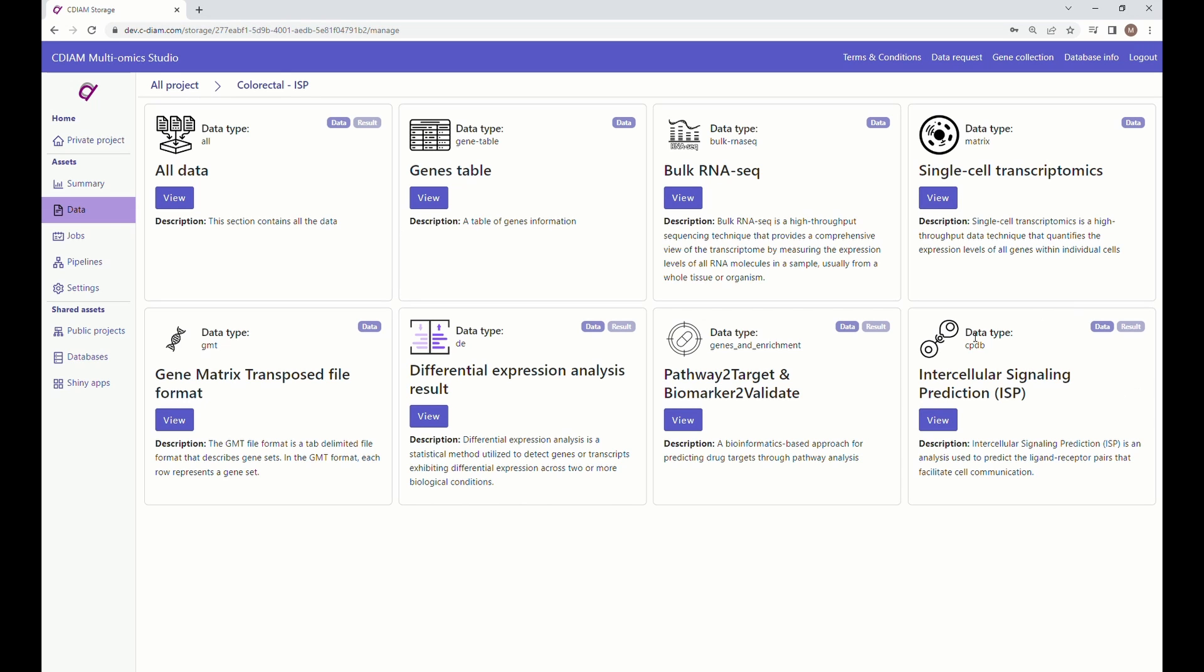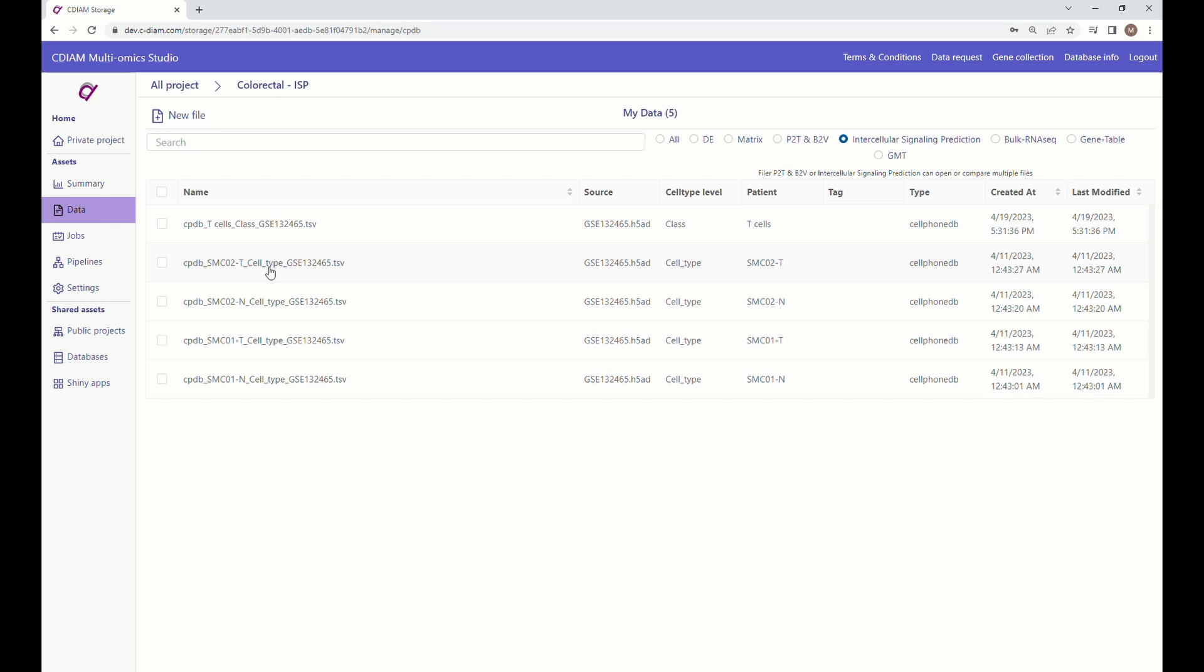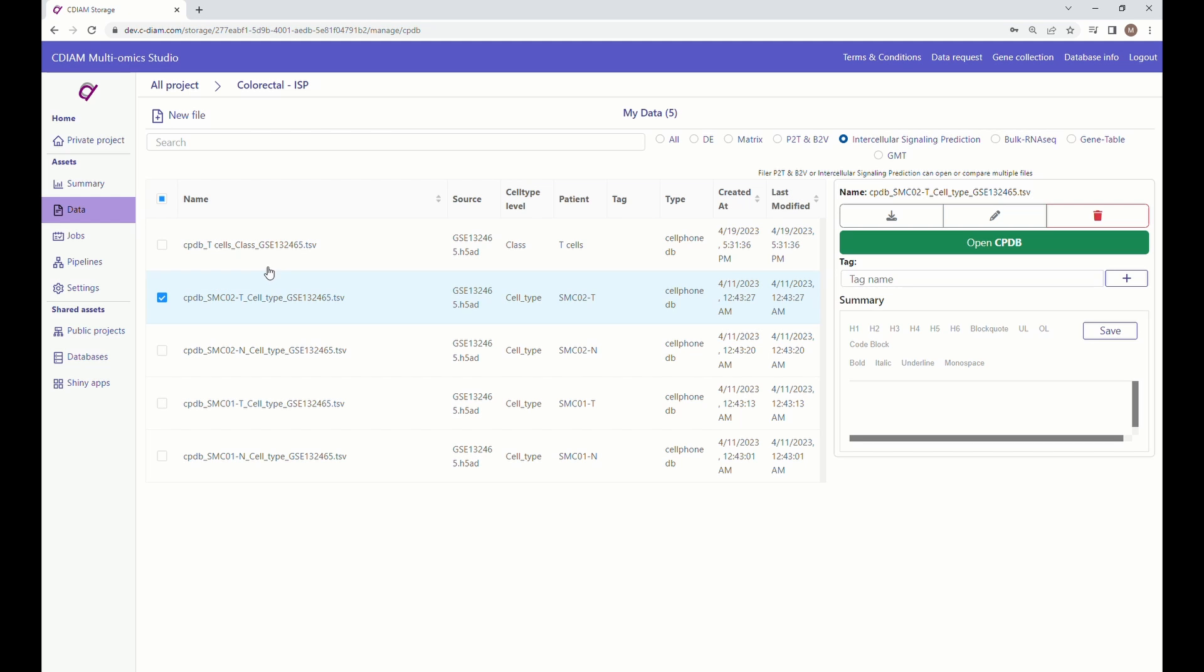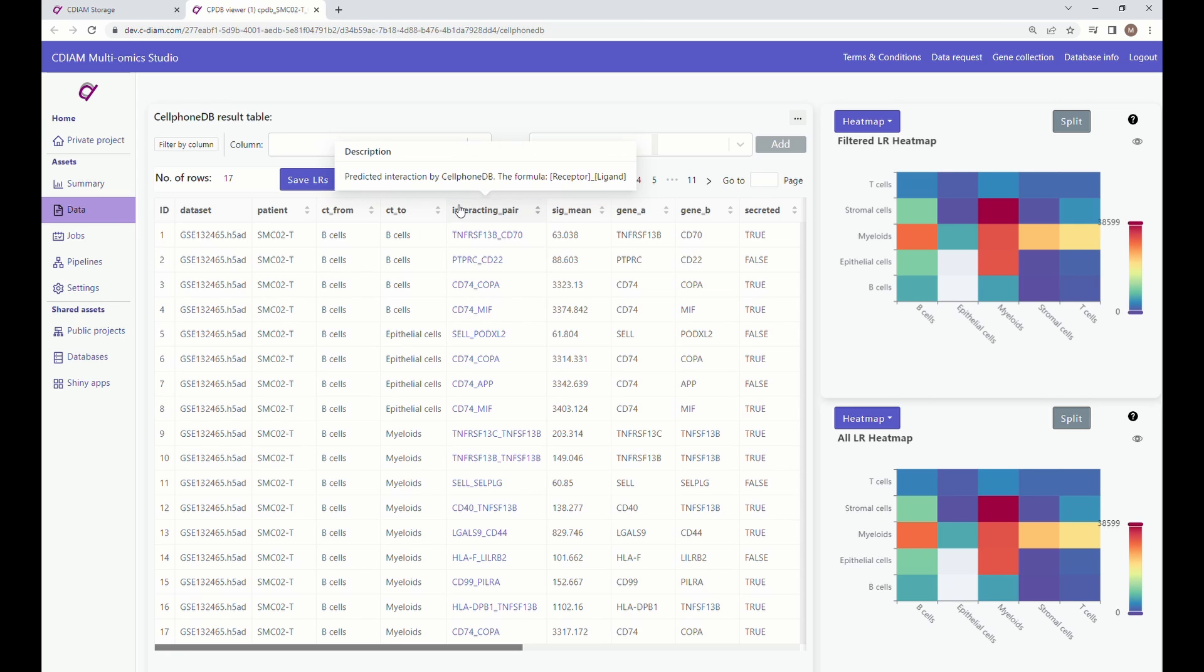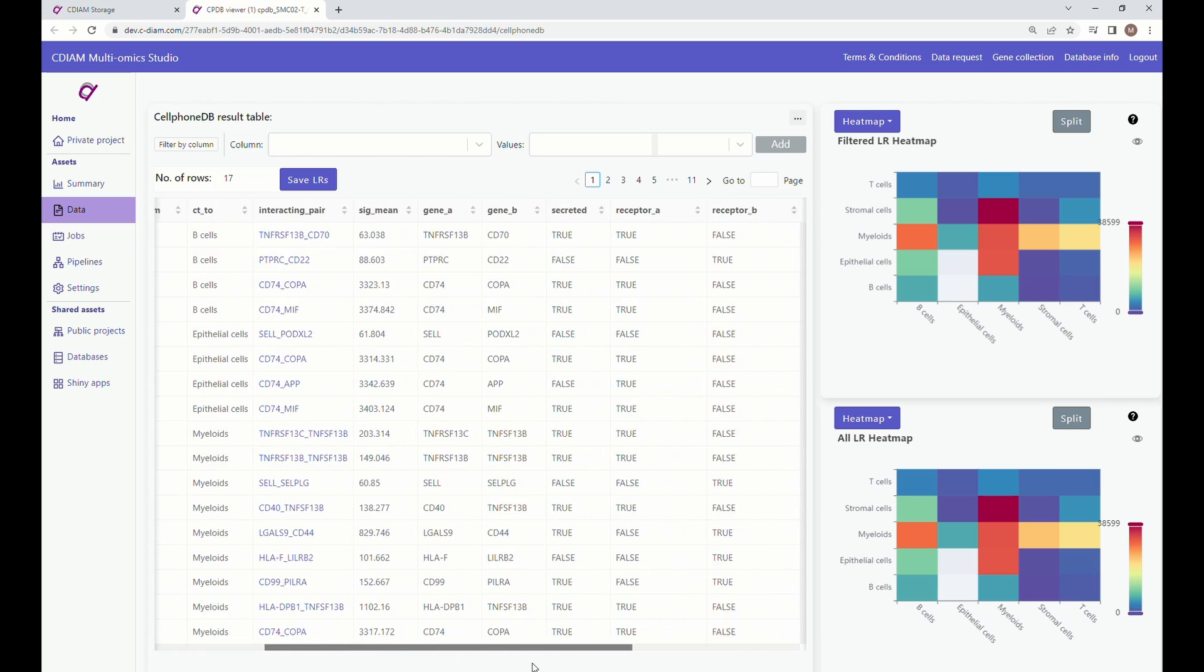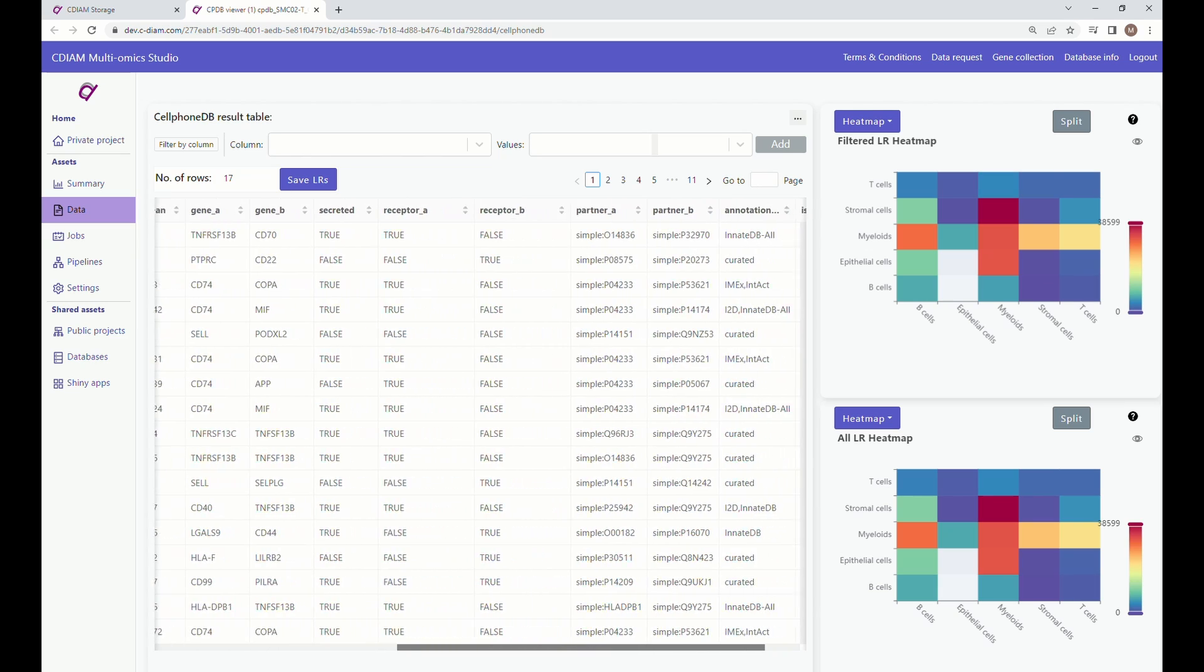When the analysis for ISP is complete, you can open the CPDB page. The page will have the result table and graphical interpretation of the data.